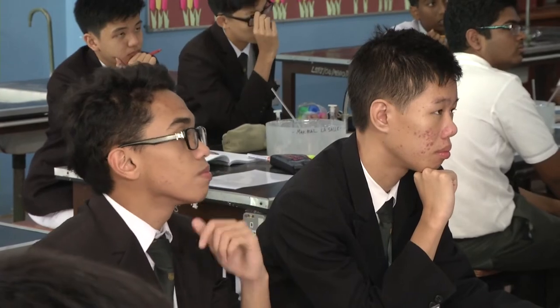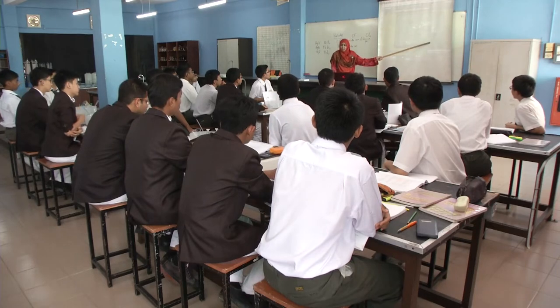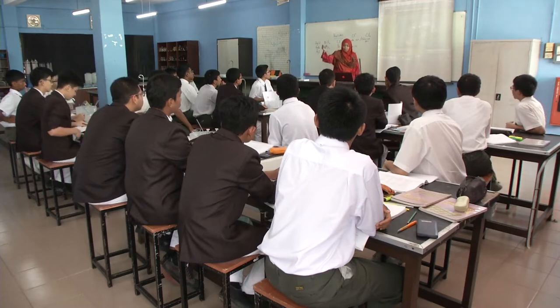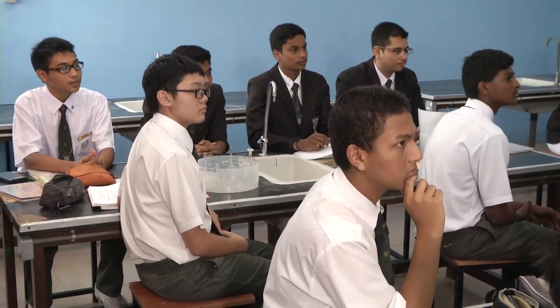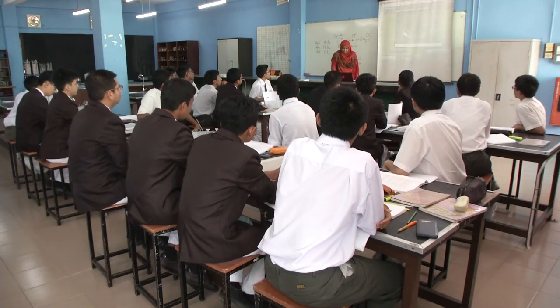So here we have two reagent bottles. One is containing potassium iodide, the other one is containing lead II nitrate. This is a very easy experiment. You just need to pour. Yours, you are getting it in a volumetric flask. So you just pour one salt solution into the beaker and then followed by the other salt solution. So it'll be something like this.